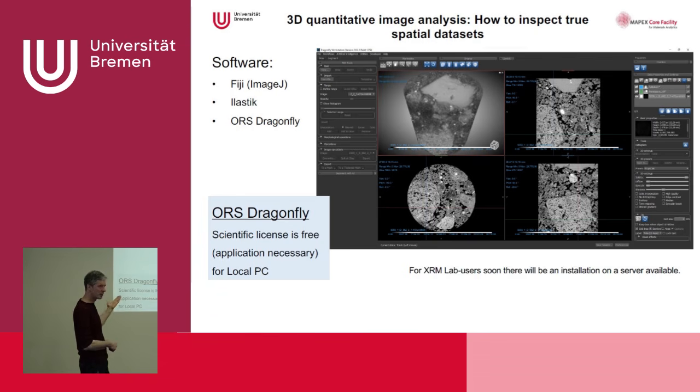You can use it on your local PC, or we will soon have an installation on a server available from the MicroCT lab in cooperation with Oliver Plümper from the Geoscience, because we applied for some server cluster. And this is where we install this kind of program. And once it works, that we can access this cluster from the outside, not only from inside MARUM, it will be available also for our customers.